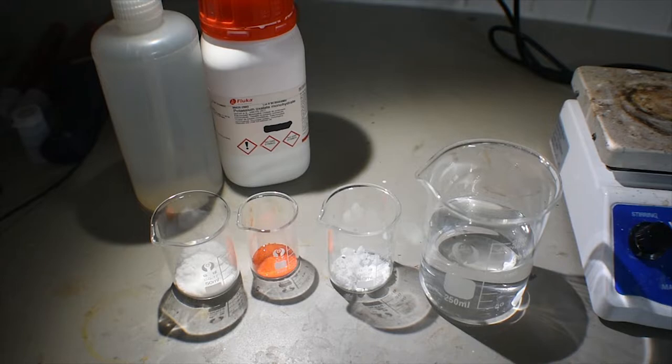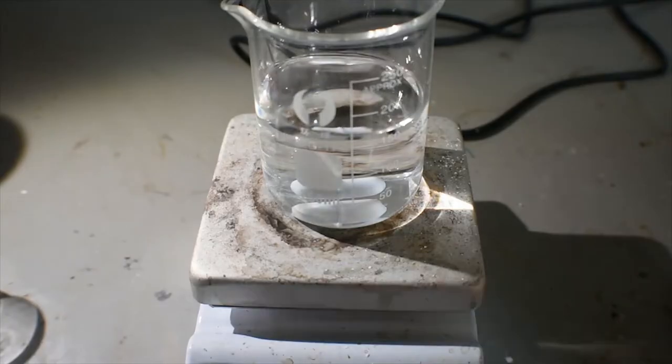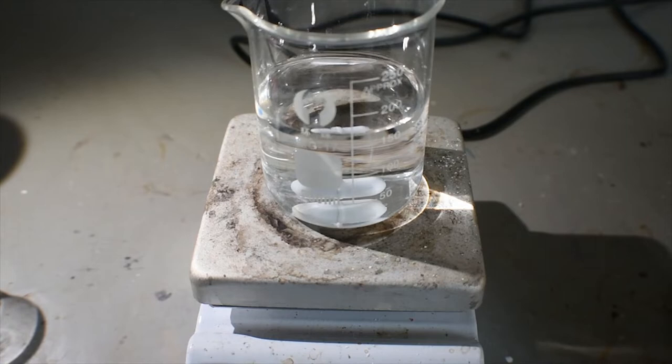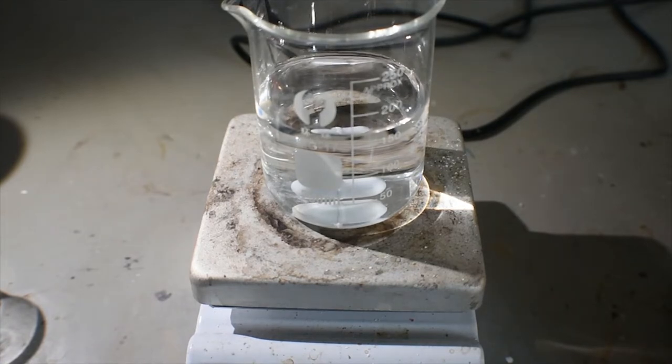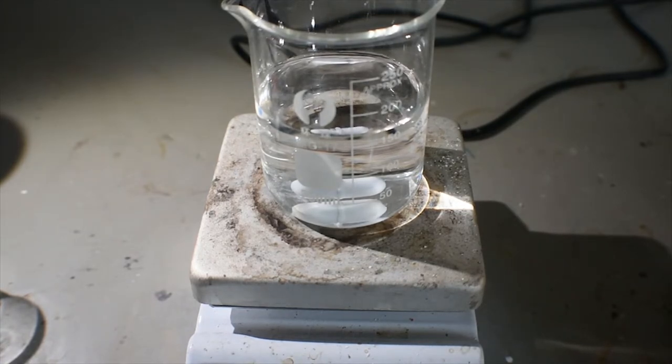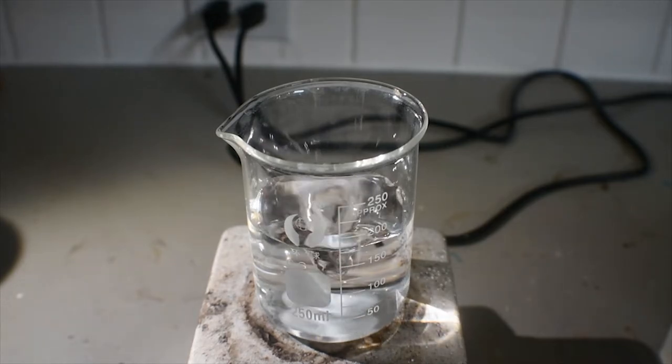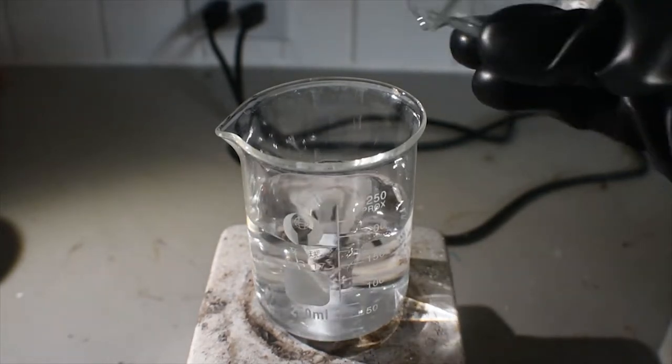This procedure obviously does involve oxalates and hexavalent chromium. With that being said, gloves are recommended. Here I have the 160 milliliters of distilled water with a stir bar. To this, I'm going to dissolve the potassium oxalate and oxalic acid. First, the oxalate.